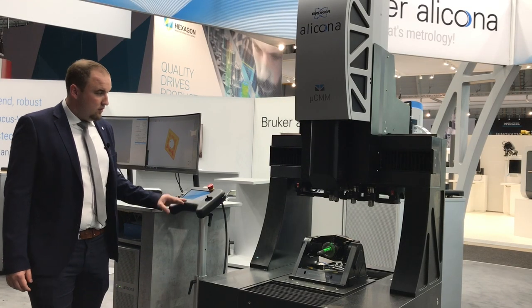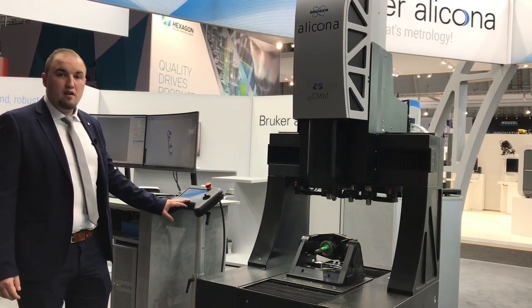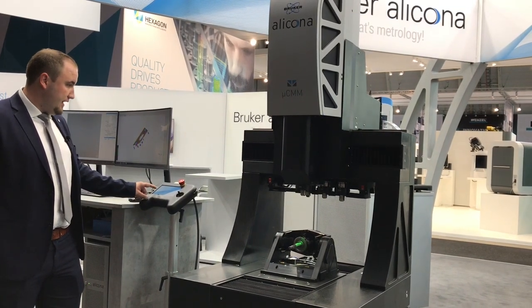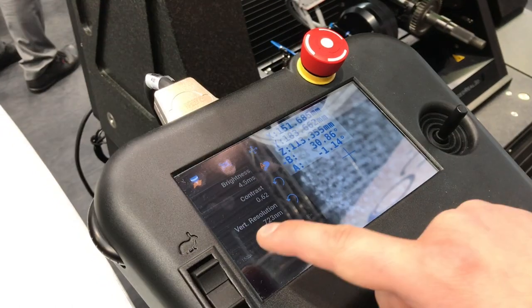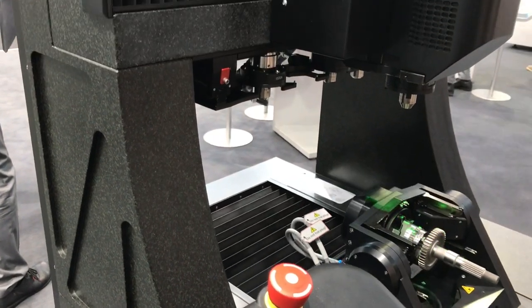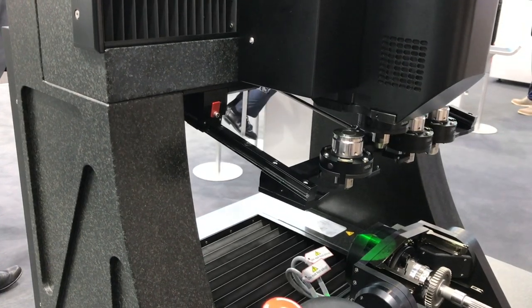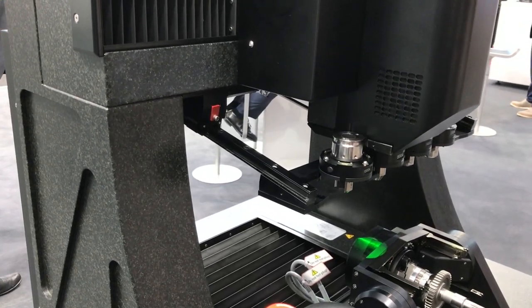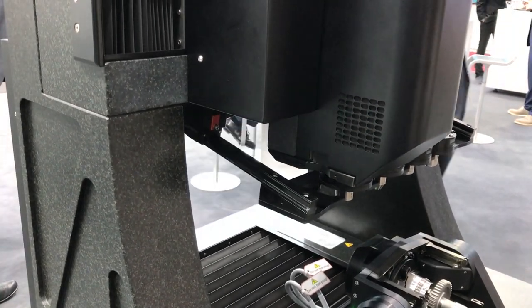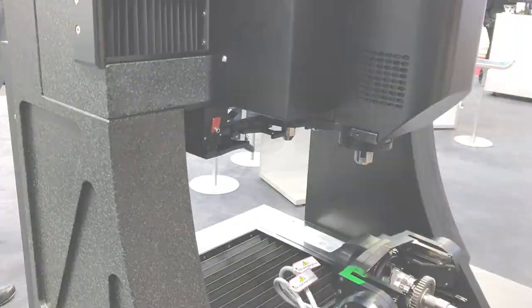Objectives are stored in a magazine, from where they can be changed fully automatically. Using the touchscreen, the automatic lens-changing system is started. As you can see, the magazine moves forward. The currently used lens is put back and is exchanged with the lens that was selected earlier. Then the initial position is restored.